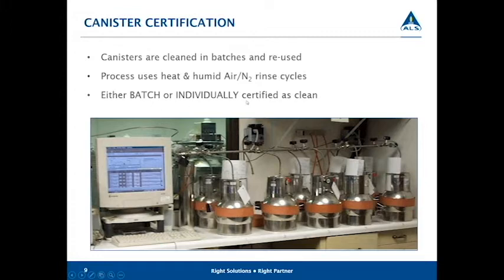Canisters are certified as clean either by batch or individually. Batch certified means that in this grouping of canisters here, for example, we would pull off one can and check it on the instrument. And if that canister shows that it's clean, in other words, no detect for VOCs, you would assume that all the canisters in this batch are also clean.